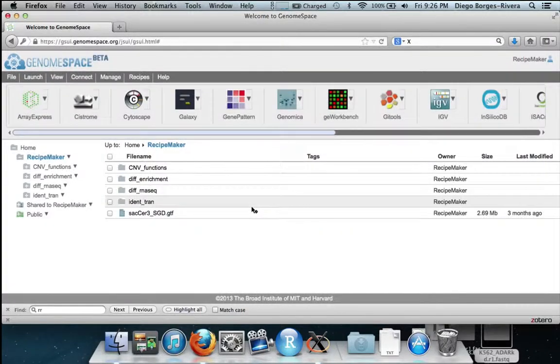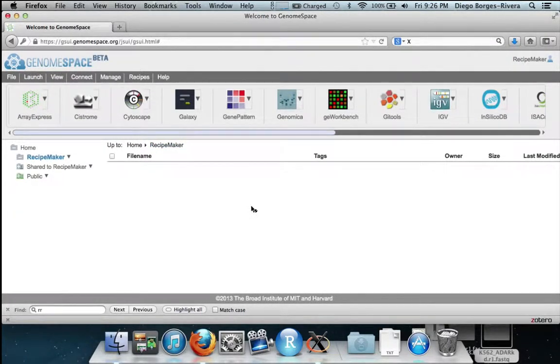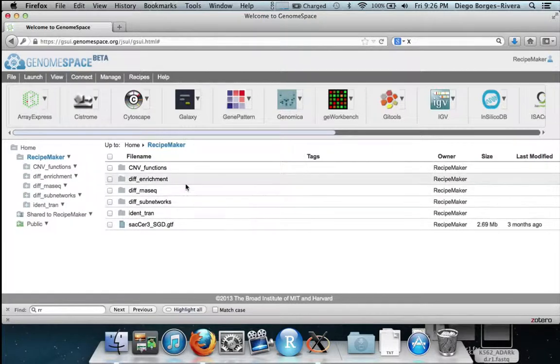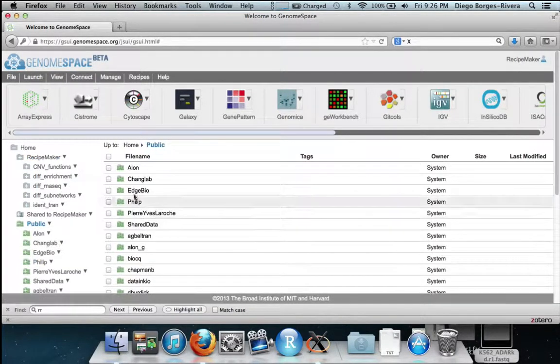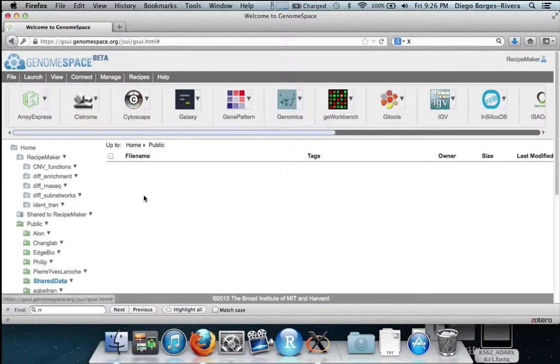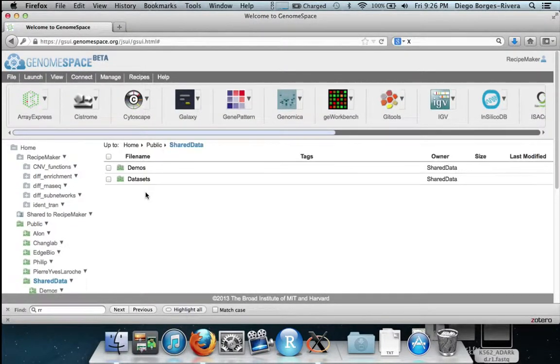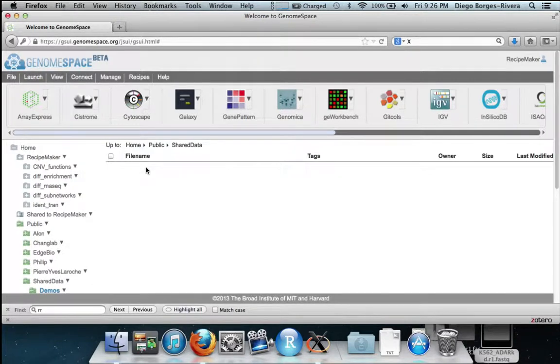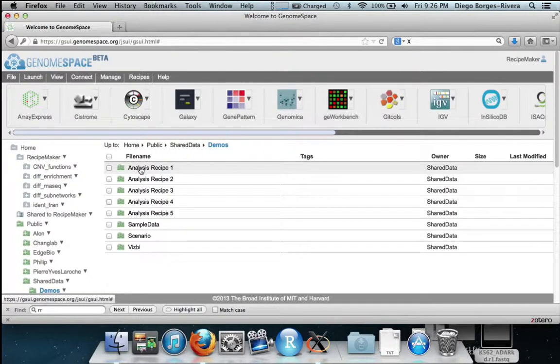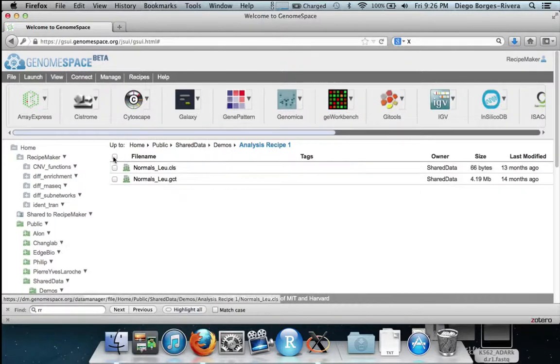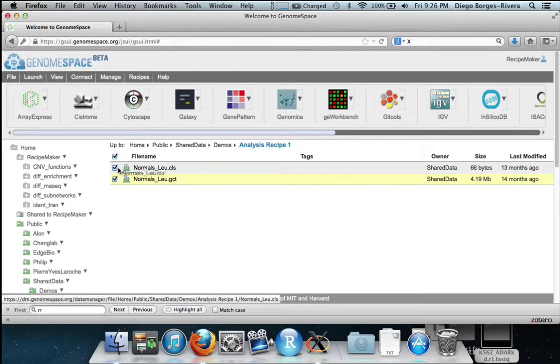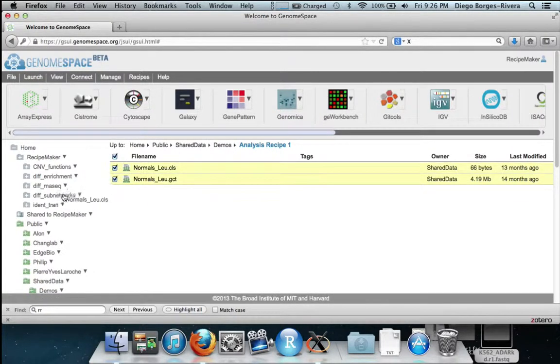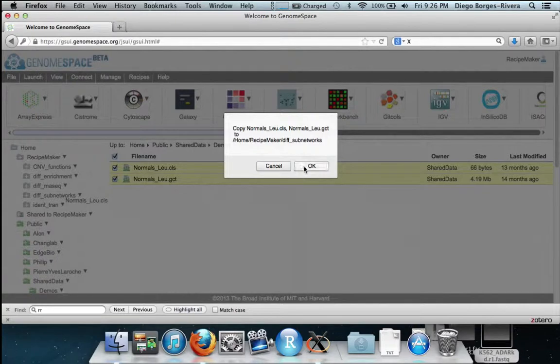We now fetch the data we will be using by going to public, shared data, demos, analysis recipe 1, and then selecting all the files and dragging and dropping to the subdirectory we just created.